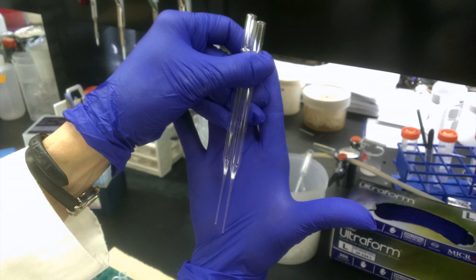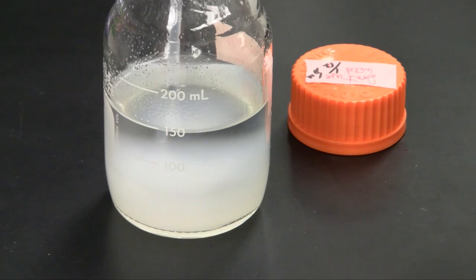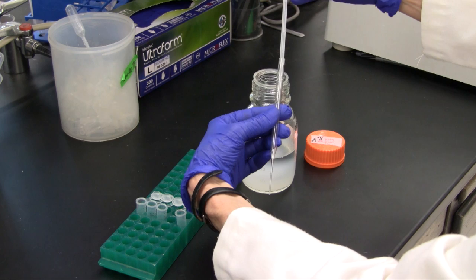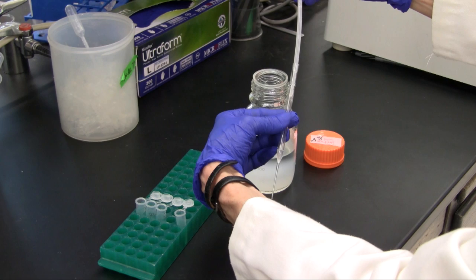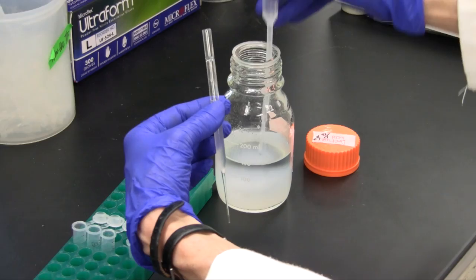The column matrix is a slurry of TE hydrated biogel P60, which has been stored at 4 degrees Celsius. The slurry is gently stirred to create a lower bead concentration at the top of the mixture. Gel from this region is used to start filling the column, after which a more concentrated portion can be used. Starting with a low concentration of gel helps to avoid trapping pockets of air in the bottom of the column. Air pockets at the top of the column can sometimes be removed with a pipette.